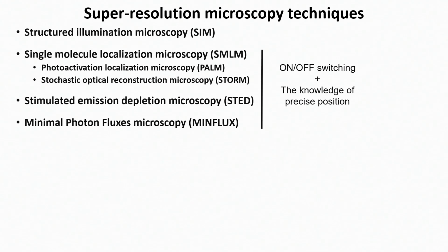However, about 10, 15 years ago, super-resolution microscopy came into the field. Basically, this was the result of many researchers thinking about how to cheat this fundamental limit. Over the last 10 years, a whole lot of acronyms showed up in the field. You don't have to remember all of them, but basically, multiple methods for super-resolution microscopy were designed. We have STED microscopy, SIM, single molecule localization microscopy, and also, more recently, MINFLUX techniques.